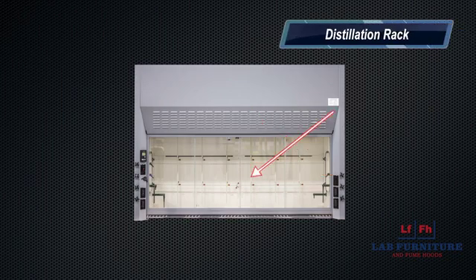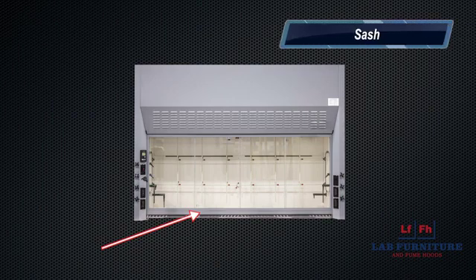Distillation racks are designed to hold your laboratory equipment and hoses. These are mounted to the fume hood on the back wall. The sash is the protective sliding glass on the front of your fume hood. The sash is also to help protect your body from any unexpected physical harm, like a bad reaction in the fume hood or potentially worse, an explosion.